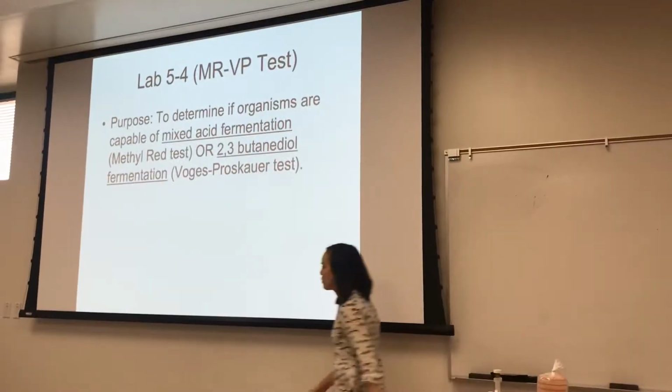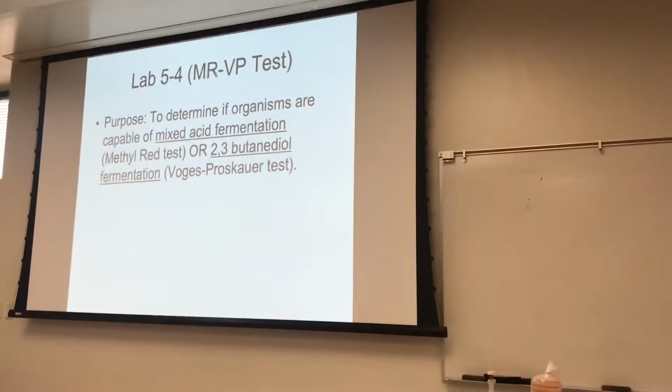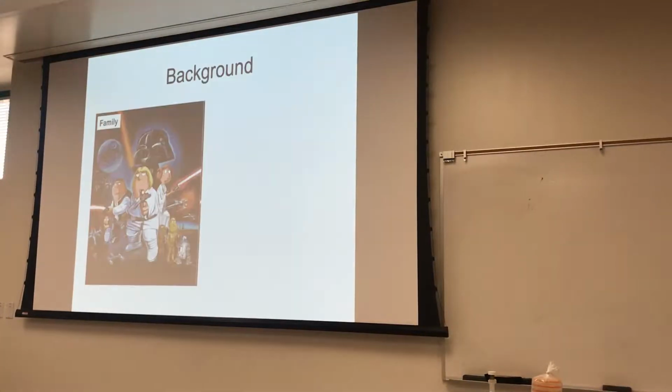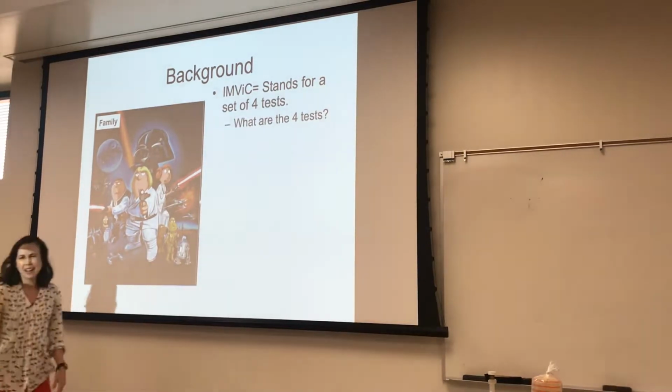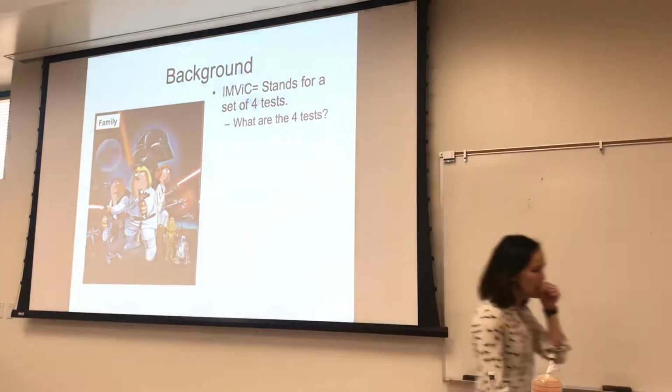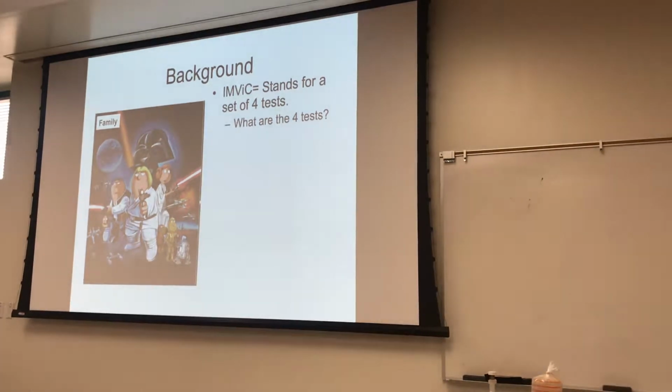So the only thing that we have to mention about MRVP is that your lab manual uses this acronym a lot, and it's a little confusing. They don't just refer to the acronym here on 5.4, but they also use it in like 5.9 and some of the other labs. You'll see it in the application part.